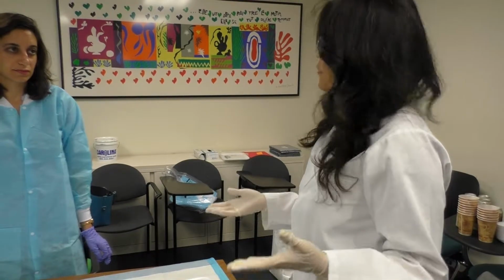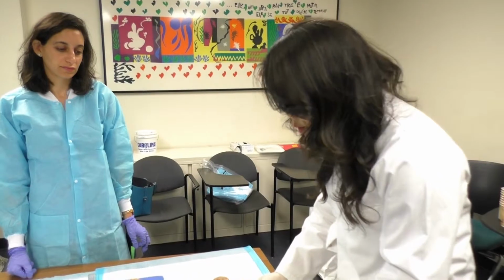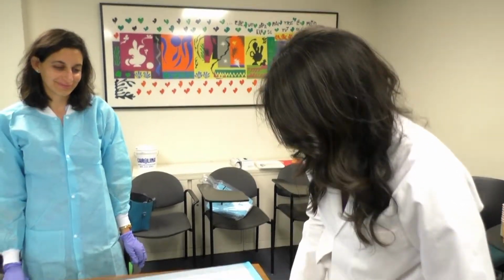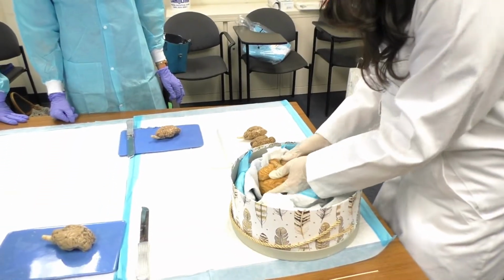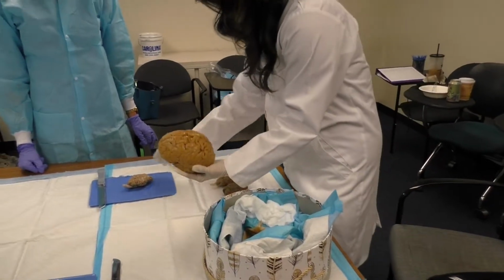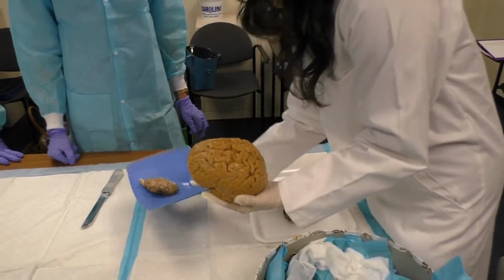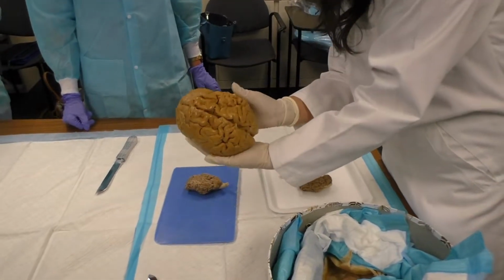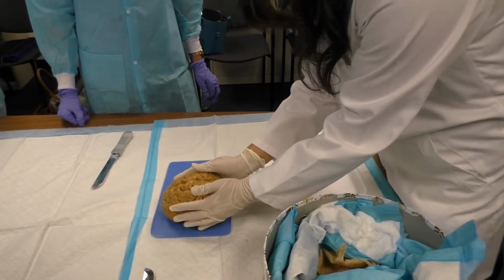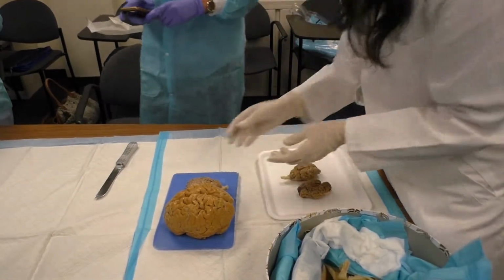But also justify why we're using the sheep brain. Sheep brain is cheap, but the most important thing is that it's very similar to a real human brain that I brought here. So it's always useful to do a direct comparison. So I'm gonna use this. And so what are the differences here between this adult human brain fixed in same chemicals and the sheep brain?